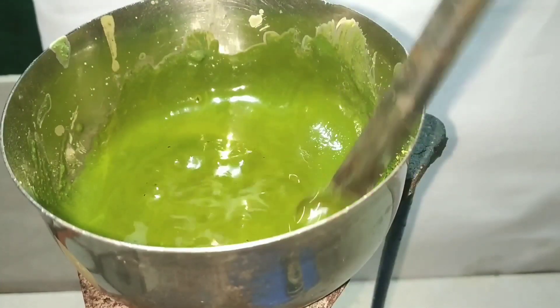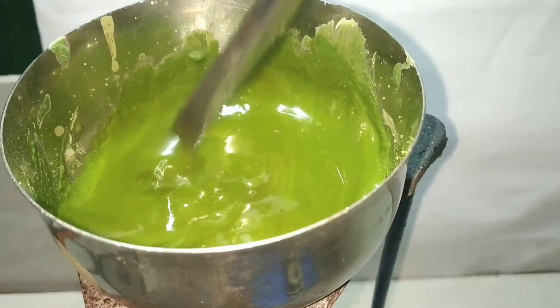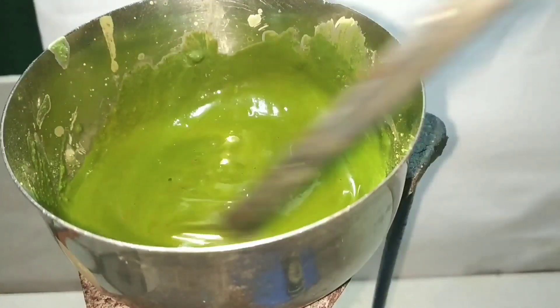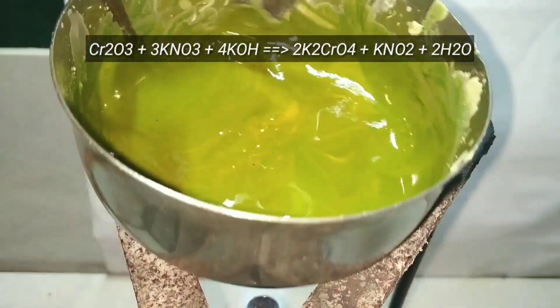After about 5 minutes of heating, you can see that the color has become a little dull, which means the reaction has started. What's happening is a redox reaction. Potassium nitrate is the oxidizing agent, which itself got reduced to potassium nitrite. Chromic oxide is the reducing agent, which itself got oxidized to the chromate state.